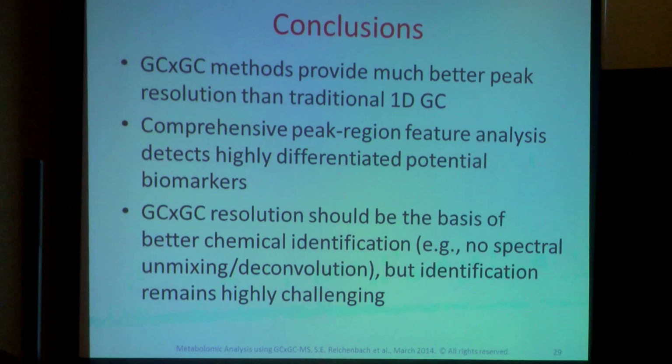We were able to match a few peaks to align the chromatograms and then look at chromatographic regions. Identification, however, still remains a very challenging problem. Certainly the isotopic analysis would be very helpful in this regard.